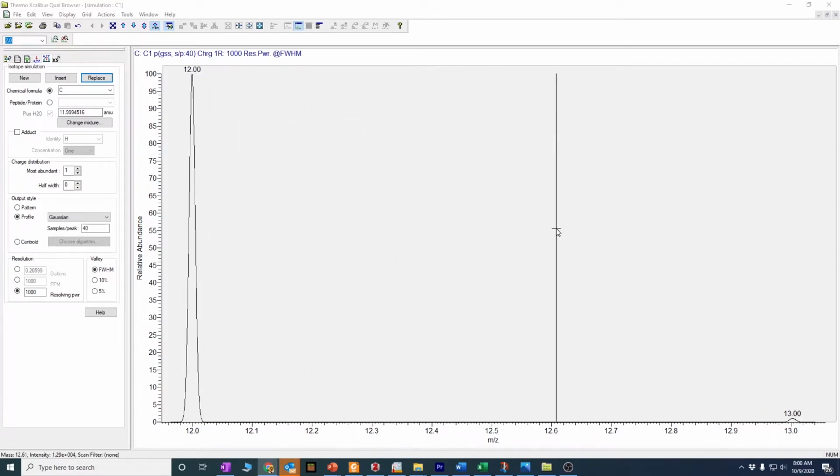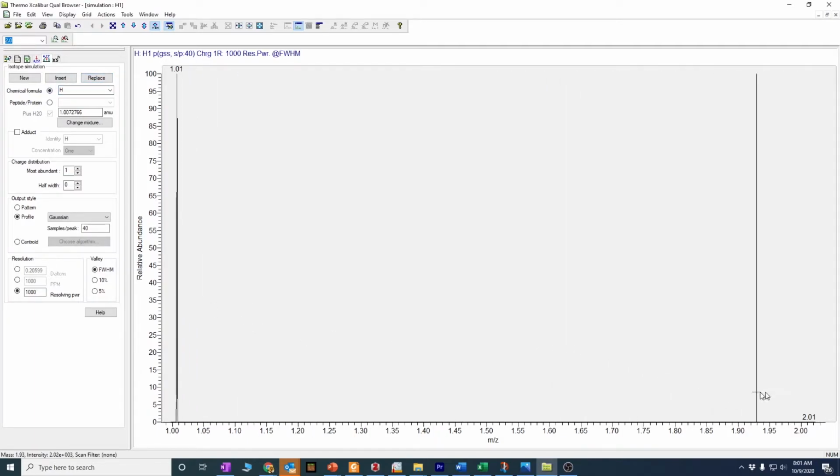We can very specifically look at the ratio of this 12 to 13 and get some good information from that if we use the right kind of mass spectrometer. So that's for carbon, but in ICP-MS you can't really look at carbon. It's too small. But the thing is, for something like hydrogen, it does have isotope peaks, but they're really tiny.